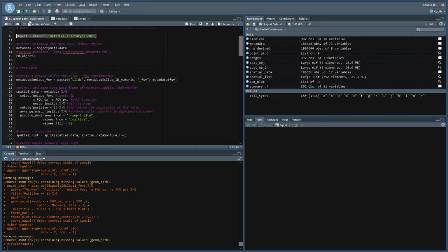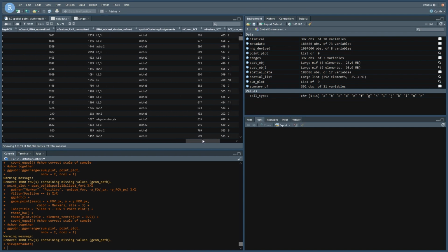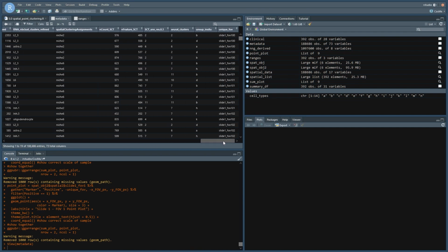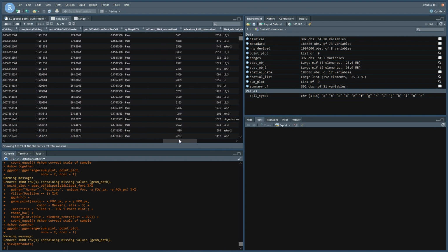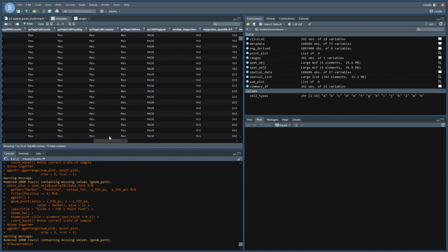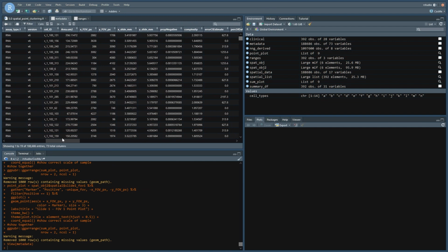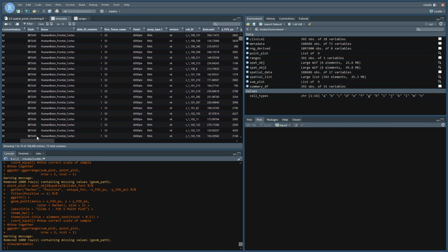And then at the end, I had added in this here. This is a unique combination of two different columns in that metadata file. There's a slide ID number, which tells you which slide they had sequenced, and then there is the FOV. Let me see if I can find the slide ID column quickly.